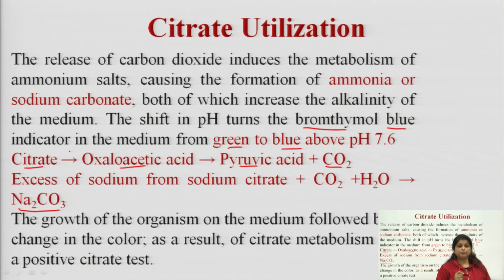Carbon dioxide will combine with sodium and make the environment basic. Sodium carbonate will be formed and your environment will become basic in nature. That basicity of the media will be analyzed with the help of bromothymol blue indicator, and your preparation will turn from green color to blue color.